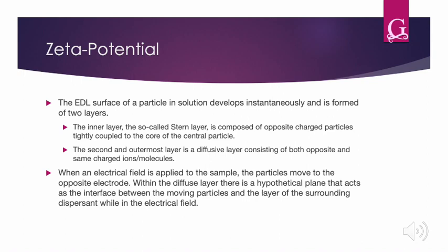When an electrical field is applied to the sample, the particles move to the opposite electrode within the diffuse layer. There is a hypothetical plane that acts as an interface between the moving particles and the layer of the surrounding dispersant while under the electrical field.